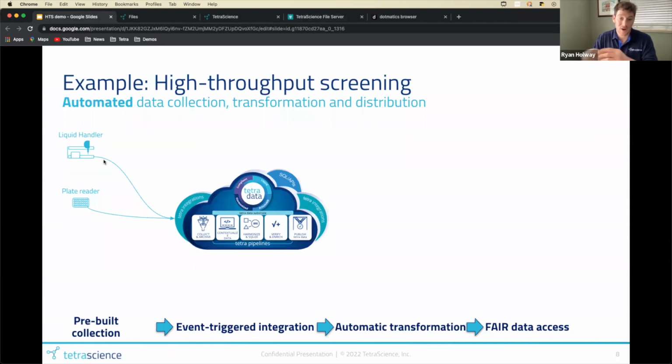And here I'm working with Envision plate reader data. The folder I dropped the Envision plate reader data into is also connected up to the platform. So as soon as the platform sees this file populate on the platform, a pipeline will be triggered to execute. So let's take a look at how that happens.